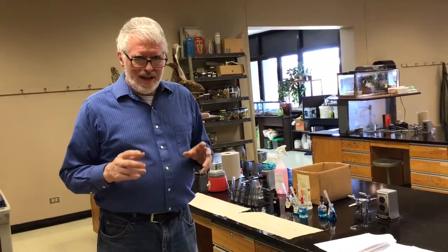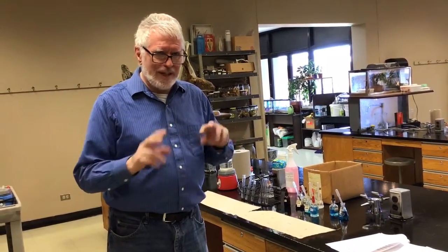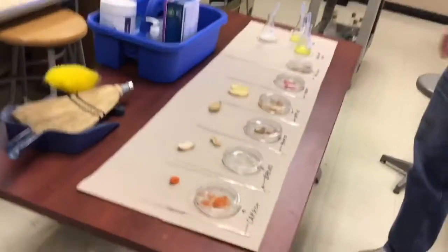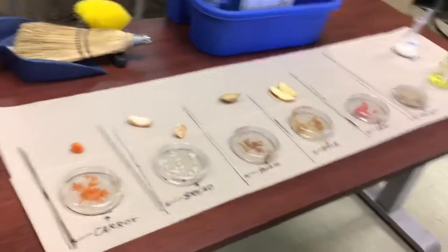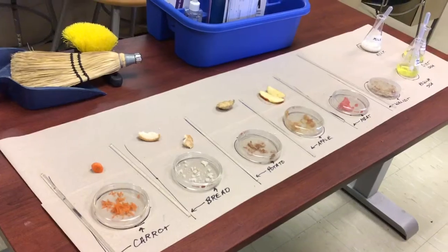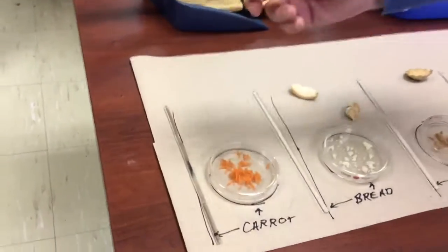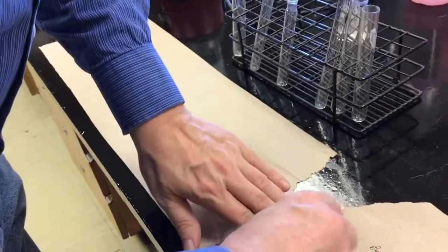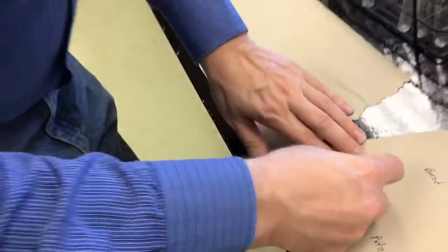We're going to start with two tests that we can kind of run in sequence. And that's the grease spot test for lipids and the Lugol's test for starch. Now over here on the table, this would have been set up for your lab. There would have been a heck of a lot more stuff here than this, because I would have had it set up for the whole room, but this is just set up for me. What I'm gonna do is one by one, and you'll see me do it. I'm gonna take a piece of carrot. Over here I've got a spot on my paper for carrot. I'm gonna try to rub it and get it to make a wet spot, which it really, really doesn't want to do.